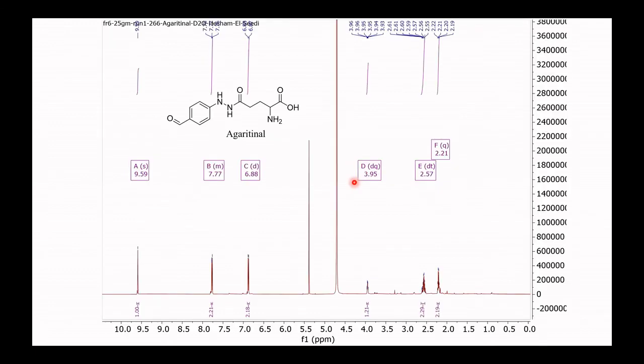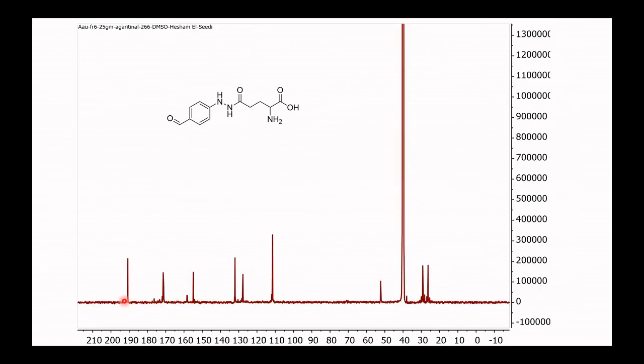You can go to the spectra like that. Can you do the assignment? In a second, I will leave you to expect which is of which. Look to here. What do you say about that? Immediately how do you recognize? And this is the aliphatic region and the functional group, right? Now you can go to the assignment. The CH2. CH is more deshielded. It is alpha to the carbonyl, right? Then the alpha amino group at almost 4, right? And then you can go to the AB spectrum as we discussed before, and the aldehydic group is good practice.